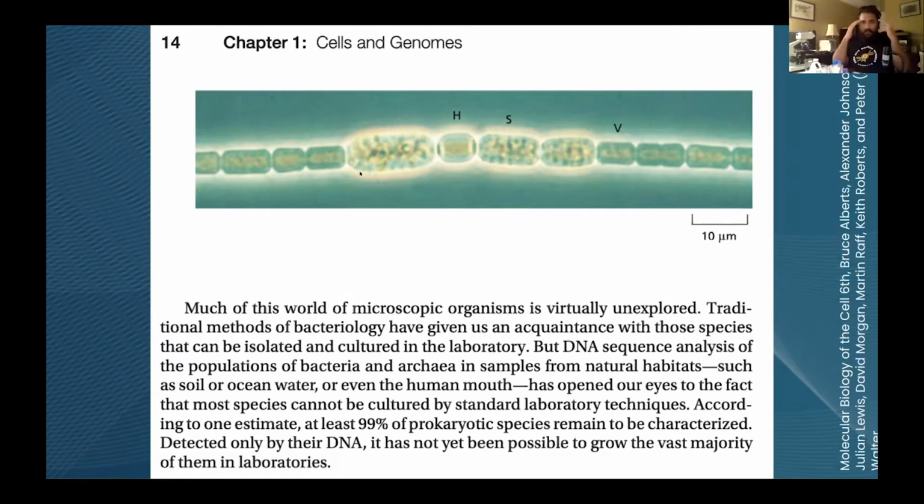So if we're looking at the methodology of taking a soil sample and putting it onto a petri dish, either with tryptone or potato dextrose to attract bacteria or fungi, we're often making this anaerobic. We're often sieving our soils and drying our soils. We're shredding all the microecology that's there. So an effective way to look at it is by doing live microscopy.